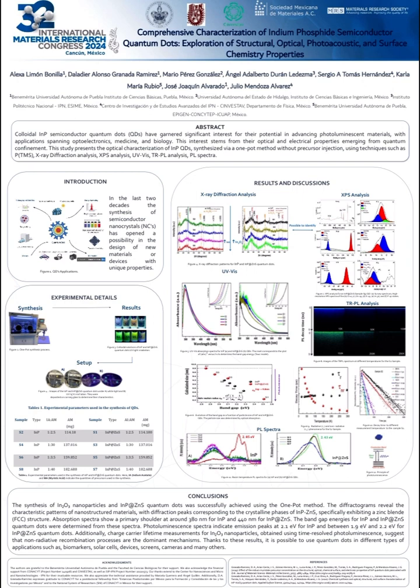graph shows. This is explained a little better with the technique of time-resolved photoluminescence, because here we can determine if our samples have radiative or non-radiative phenomena. So here for sample number 2 we can see that the non-radiative phenomena predominate. That means that in our sample, many steps are needed before a photon can be emitted. And this, in terms of photoluminescence applications, is not very useful because it will take too long to do its job.